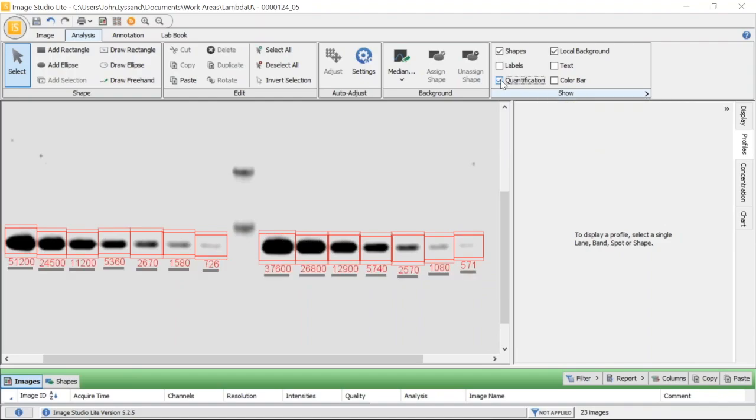So now we can go ahead and see our reported values. In Image Studio, we call this final value signal.